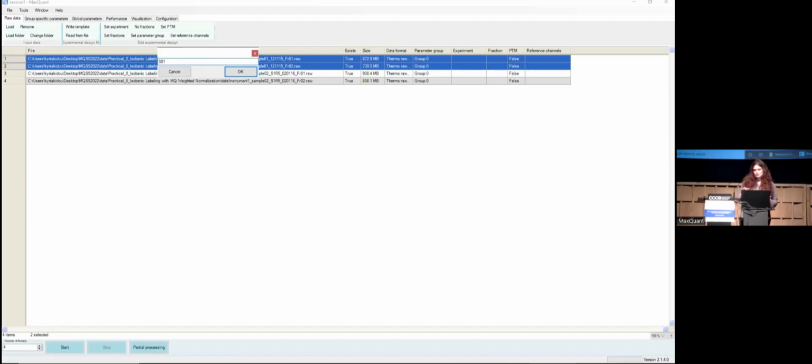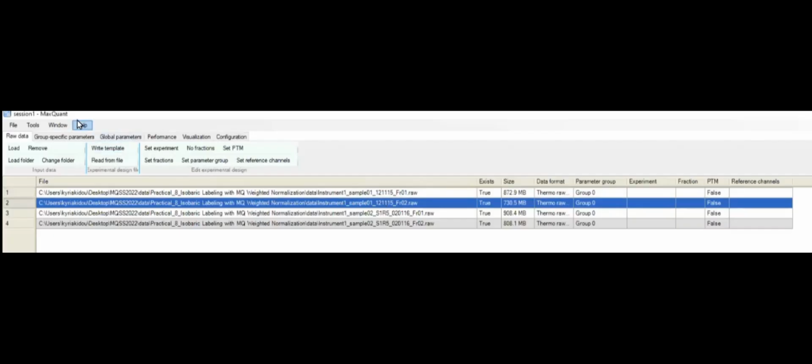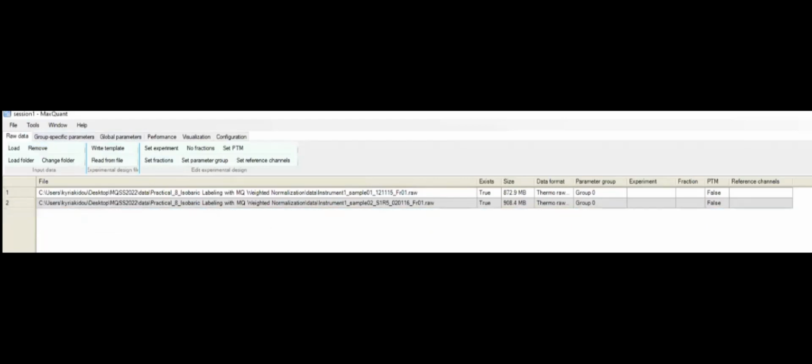Just you need. Yes, sorry. Yes. You have 2 files. You have the first one. Okay. Okay, just select only one. Probably it was because of the size of the USB. Sorry. Maybe can you remove also the other 2? Yes, maybe I can remove. Exactly, good idea.